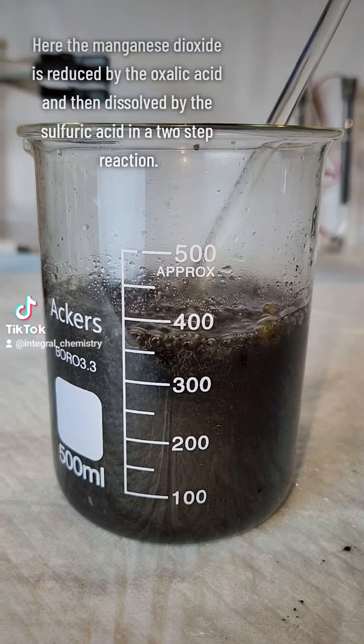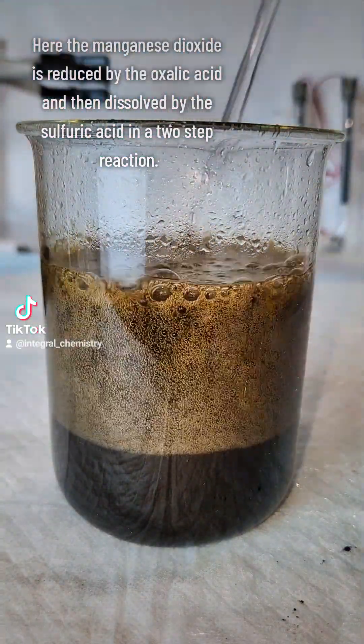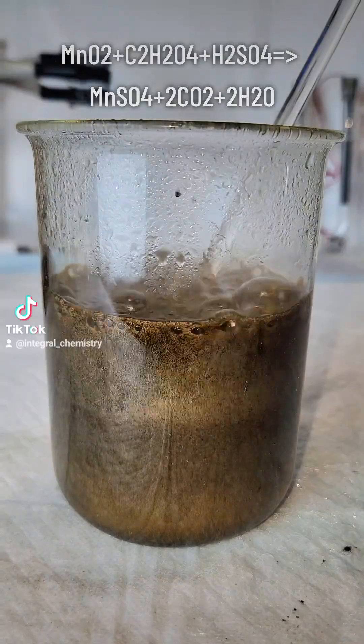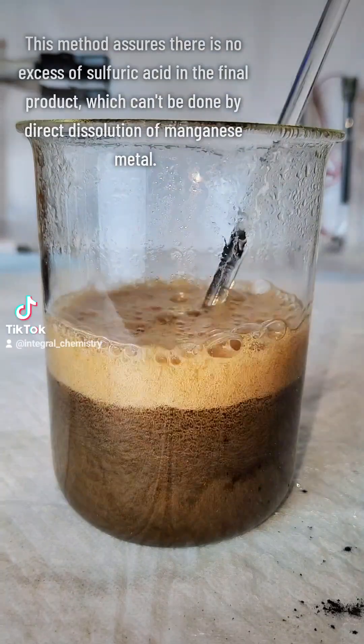What's happening here is a two-step chemical reaction where the manganese dioxide is first reduced by the oxalic acid and then dissolved by the sulfuric acid to produce manganese sulfate, carbon dioxide bubbles, and water. These additions are made until no more bubbling occurs, which indicates that the reaction is complete.